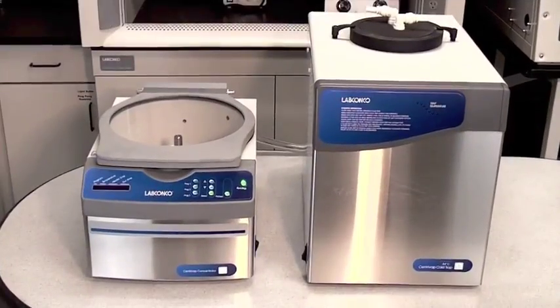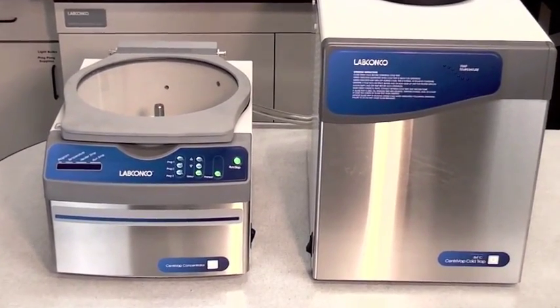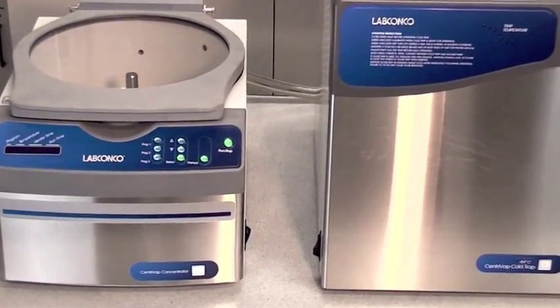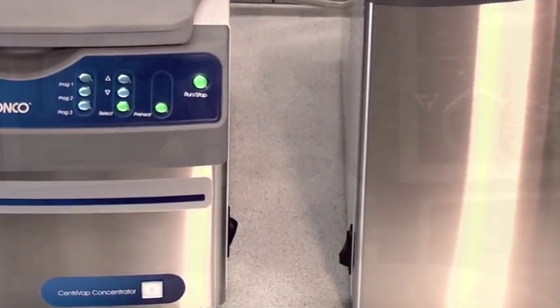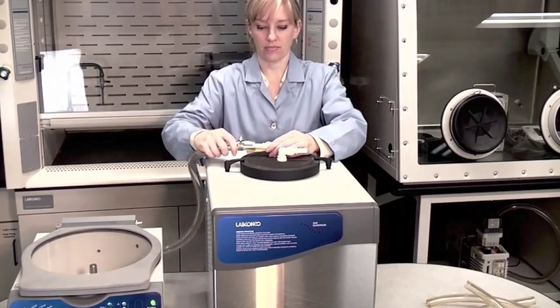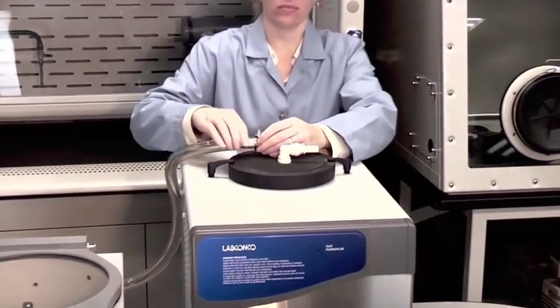Next, place the cold trap next to the Centravap. Allow a minimum of 3 inches of air space on each side of the cold trap to prevent restriction of airflow. Attach the hose from the Centravap to the cold trap connectors.